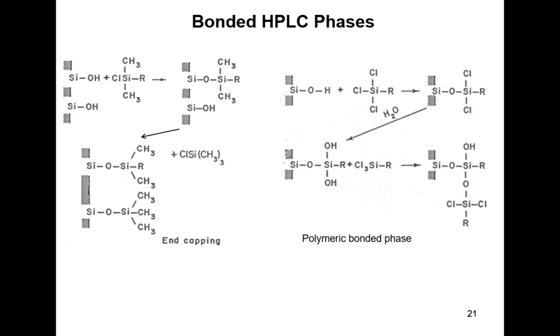Yeah, this expanding network of chains branching out from one initial oxygen atom, and we're not trying to modify all of the OH groups on the silica, but for the ones which remain unmodified, there's such a dense network of hydrocarbon chains clustered around them that your sample molecules can't access them so easily.